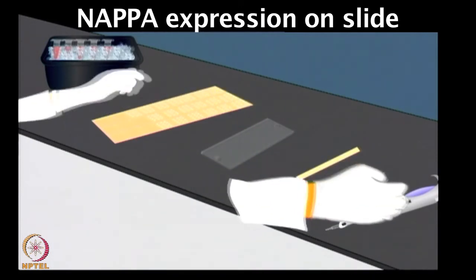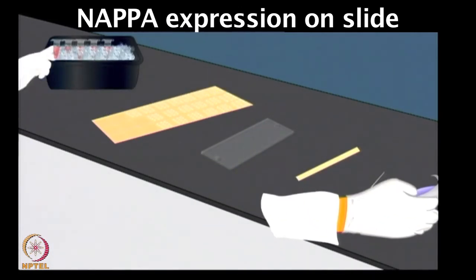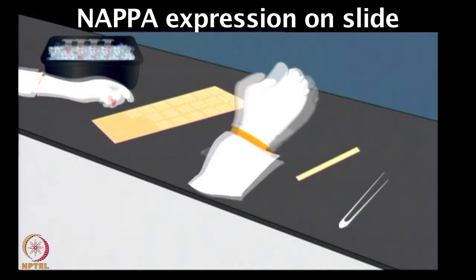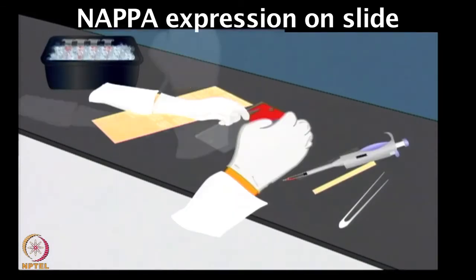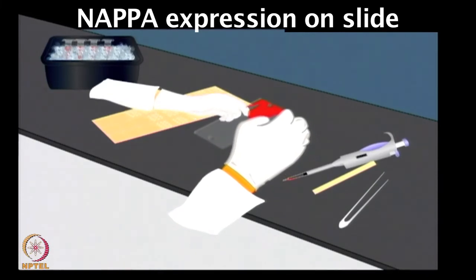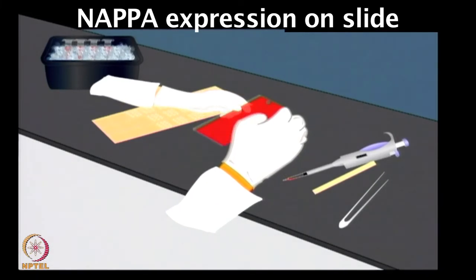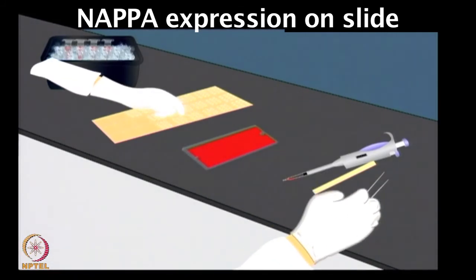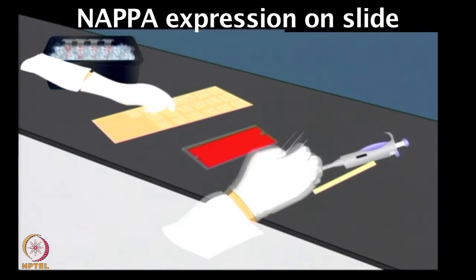So, first you need to prepare the in vitro transcription translation mix, which contains TNT buffer, T7 polymerase, amino acid, RNase inhibitor and DEPC water. Apply that on the slide, which contains the HybriWell gasket, and then seal the pores.